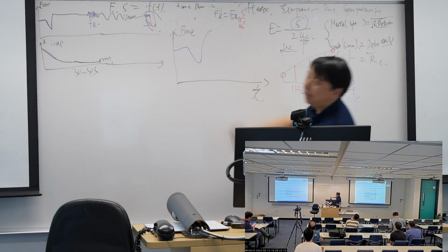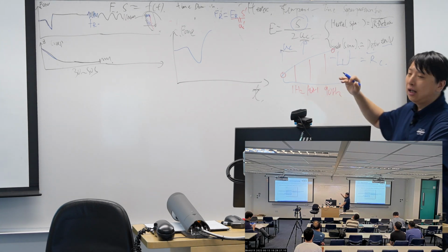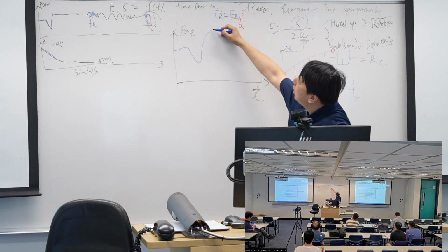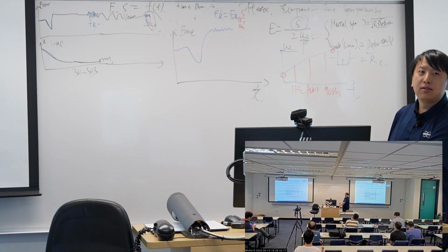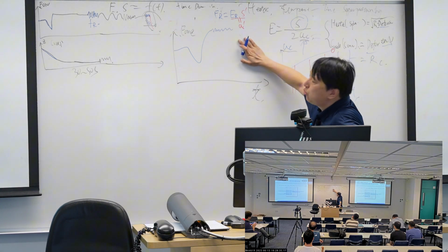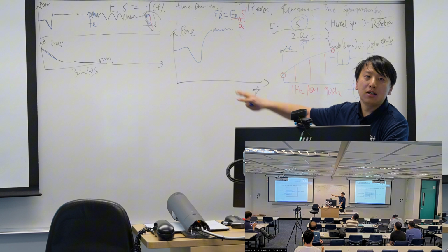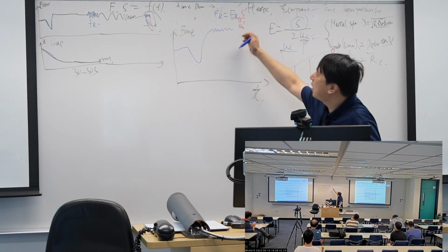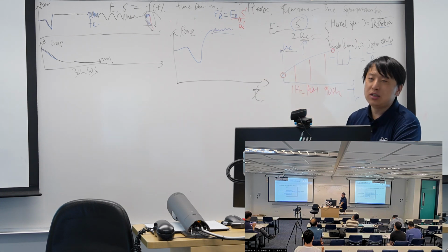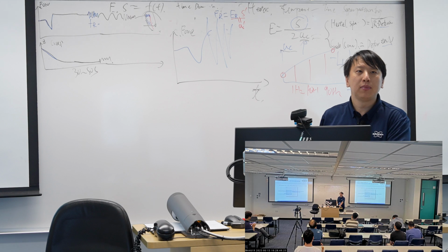So we would apply a force at the beginning, and then we will hold the force. And during the hold, we will do the modulation. And the idea here is we don't want to introduce a large modulation, as such, we would change the deformation too much. So we want some tiny modulation. We don't want the huge modulation.